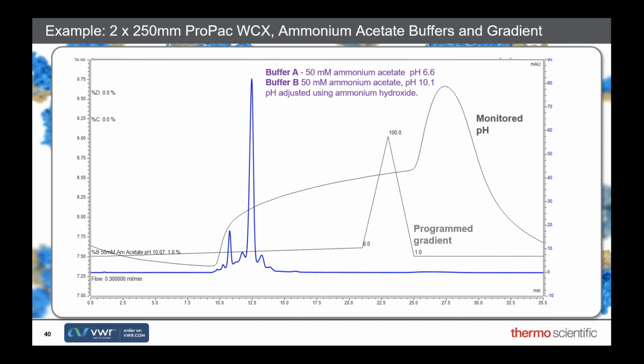This is also the counter ion in cation exchange, so a salt gradient is actually being performed, and with high salt. And the ammonium acetate does not buffer as expected, giving much higher actual concentration, causing yet more equilibration problems. So, although this method would give you a result, it would be very difficult to reproduce from column to column.